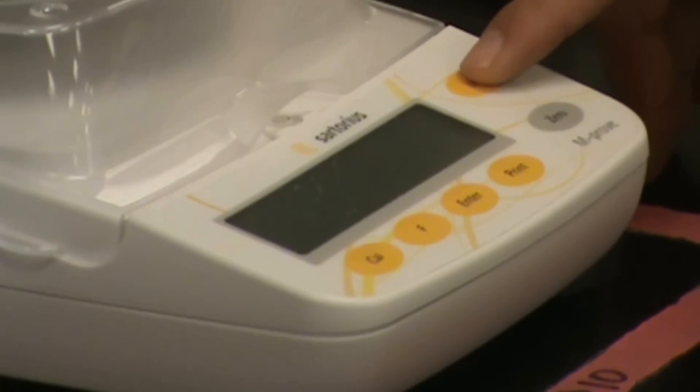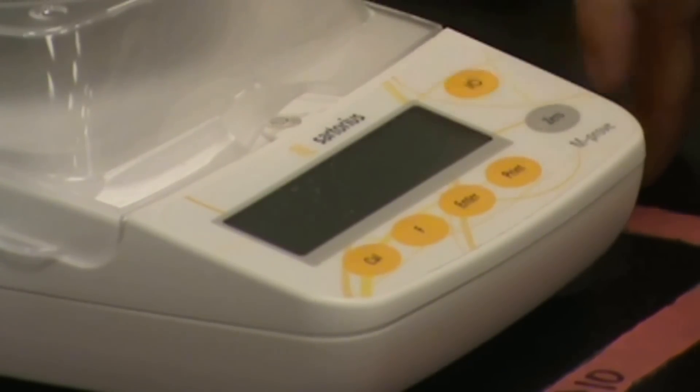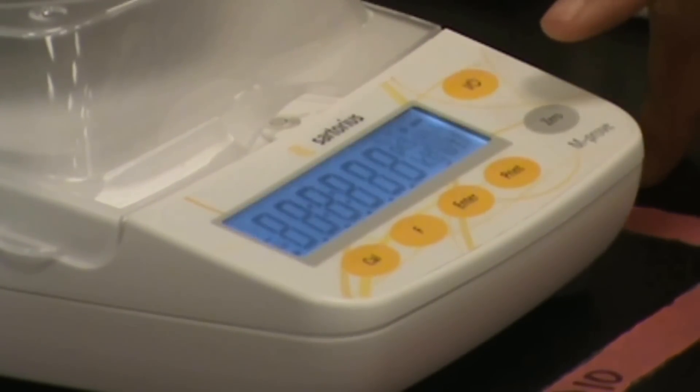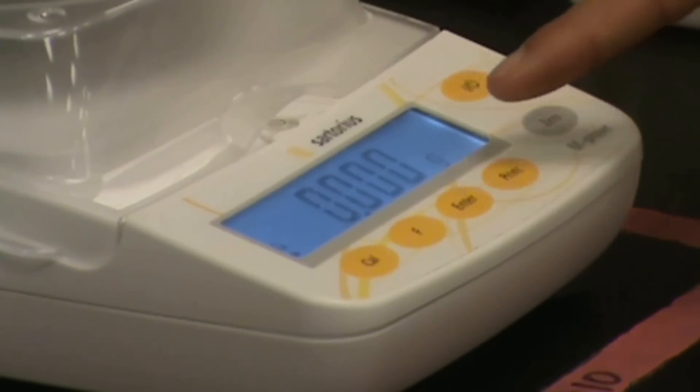I'm going to hit the power button now in order to turn on the instrument. And you'll notice the boot up screen. After a few moments, zero gram should appear. And at this point, you want to double check that your units are indeed displayed in grams, indicated by the G right here.